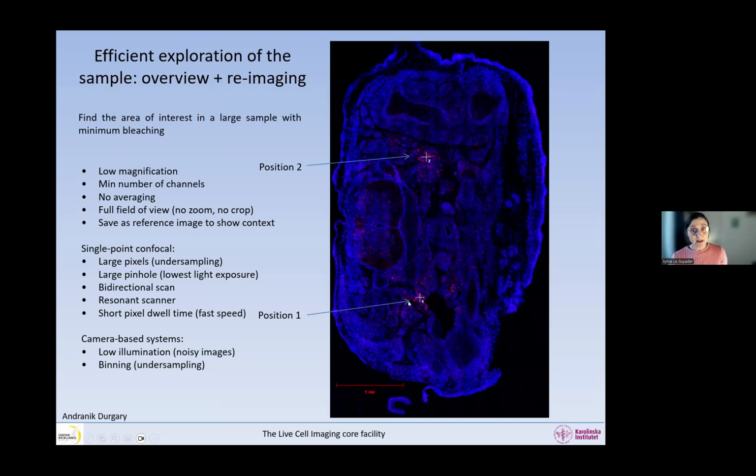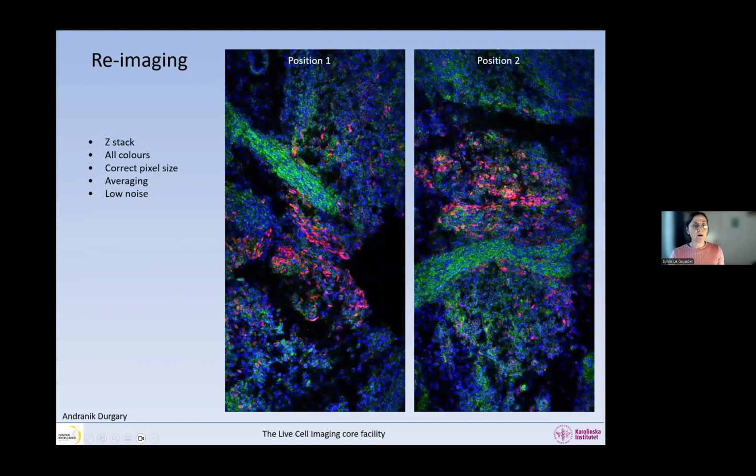Okay, all these type of things I will show you when we start the workshop tomorrow, Fridays and Mondays. I will show you how to do this, but remember that anyone who has an automated stage can do what I'm showing right now. This is a very powerful way to navigate in your sample. So any system that is automated in XY can do this sort of things.